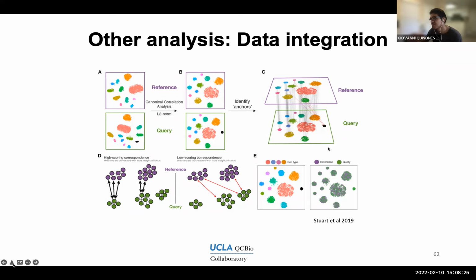And as you can see, hopefully you will get a 1-to-1 match, but it's not always the case. Sometimes what are considered two different clusters in the reference are actually considered only one cluster in the query data set. Or maybe a cluster may not be present at all in the query, like the distance is too big to any other existing cluster.